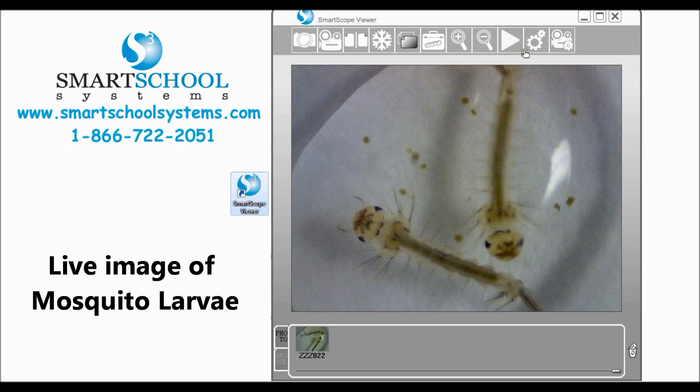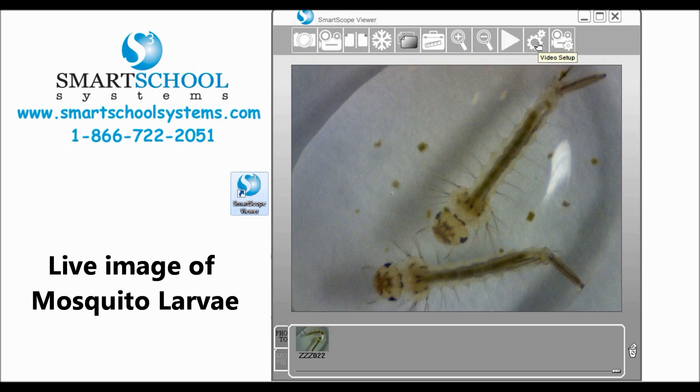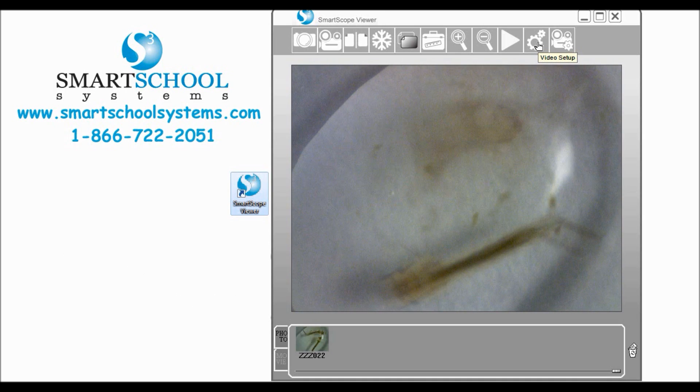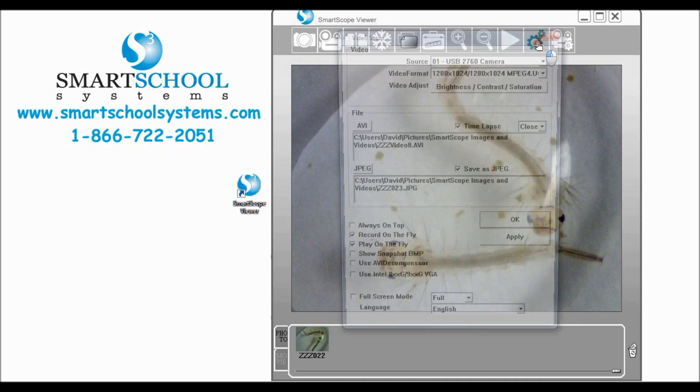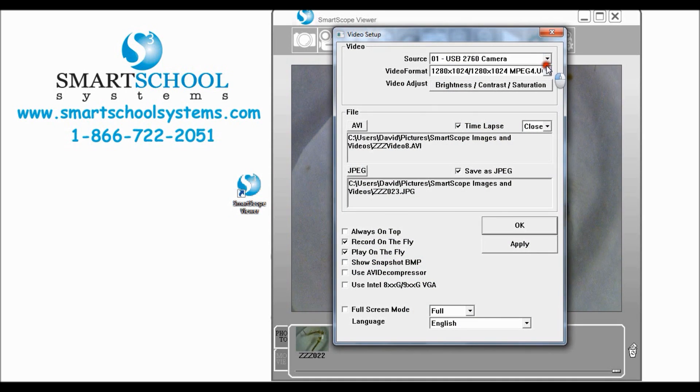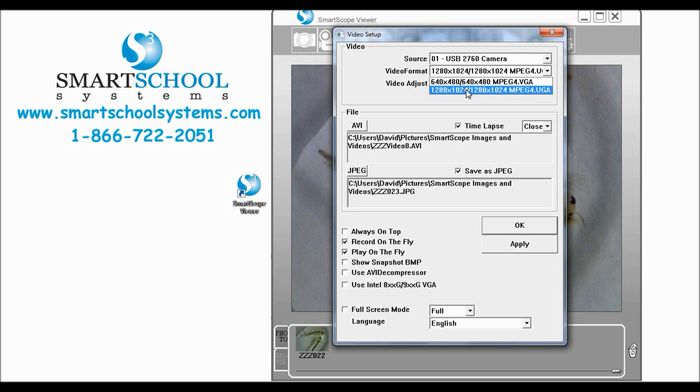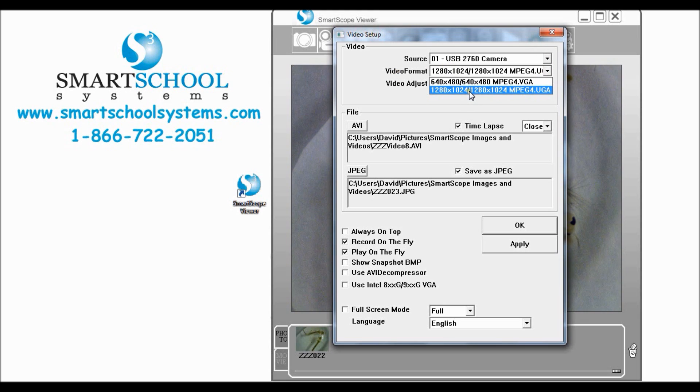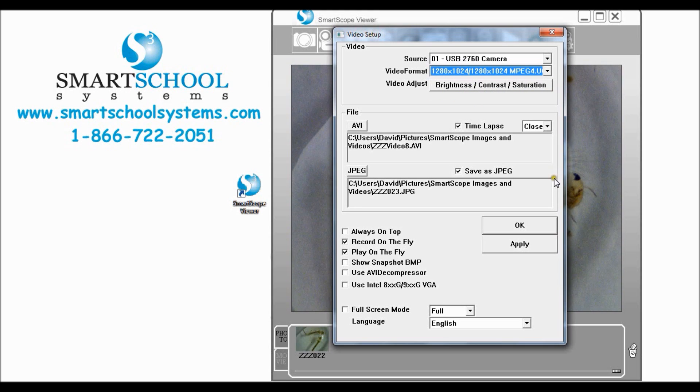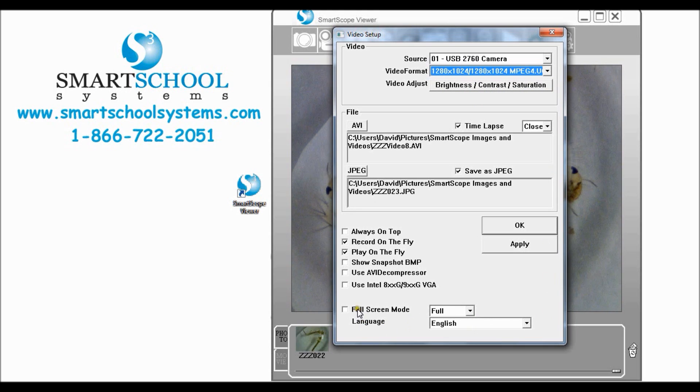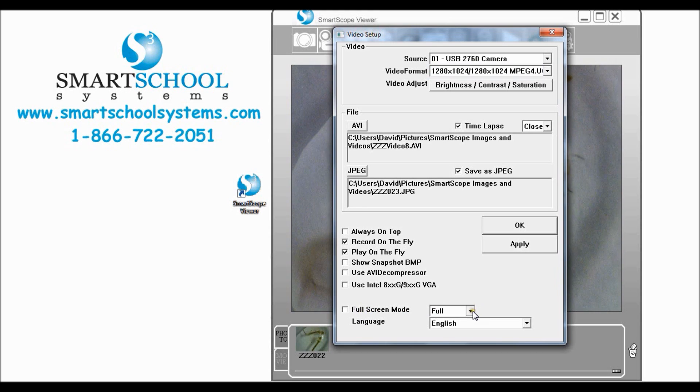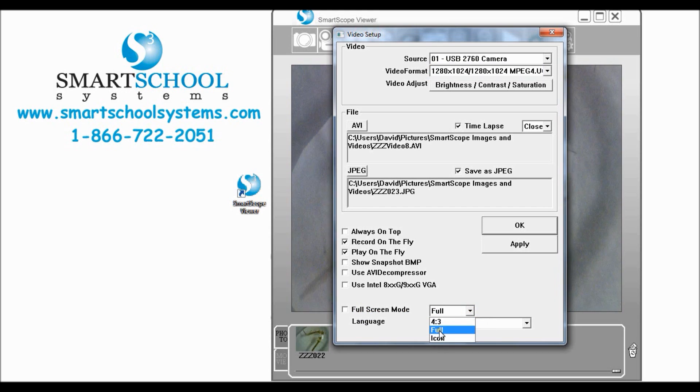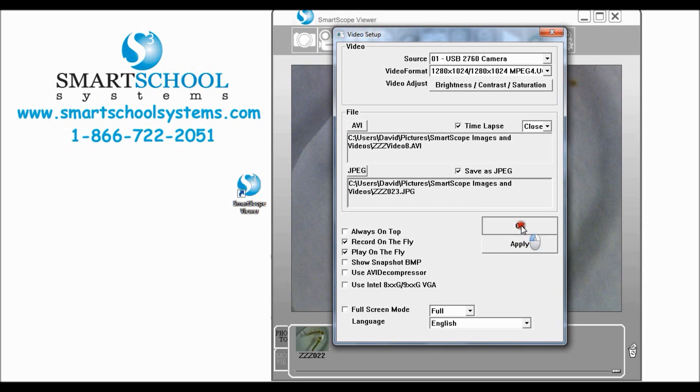Let's go ahead and move up here to your video setup with the two little gears and check a couple of things first. Go to video format and change to the higher resolution which is 1280 by 1024 and that is going to give you some good quality images. The next thing I'd like to do is come down here to full screen mode. We have a couple of options but let's choose full and click apply and ok.